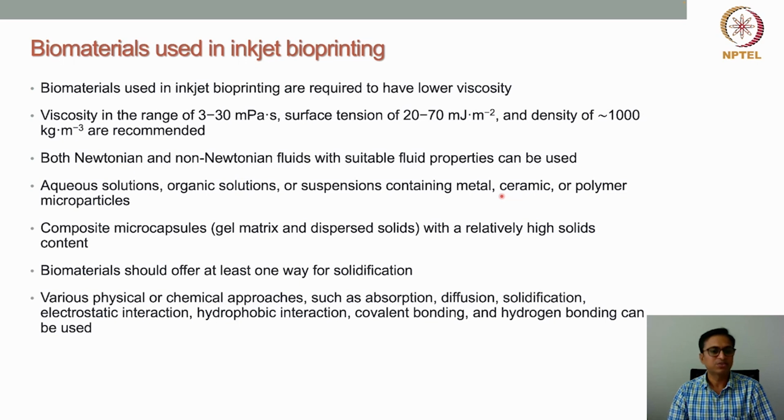So biomaterials should offer at least one way of solidification, so that after printing the structure is stable and the structural fidelity, that means the way the structure is built, is maintained.